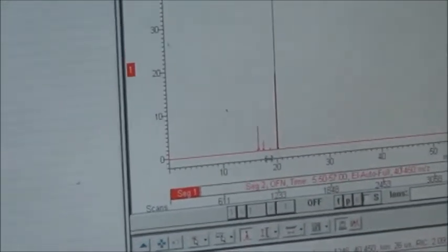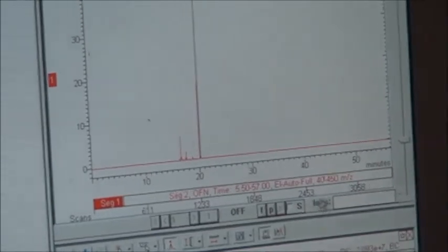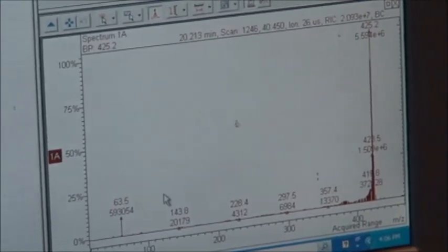Each peak represents separation. On the x-axis, that's your time in minutes. The bottom section represents the MS component, which is the actual fragmentation pattern of the sample.